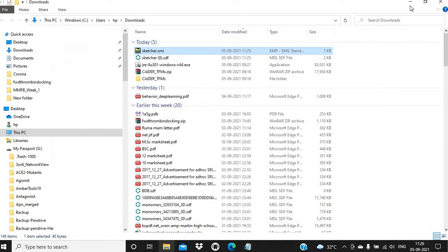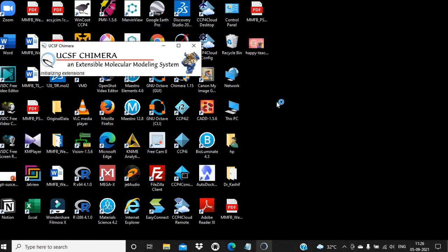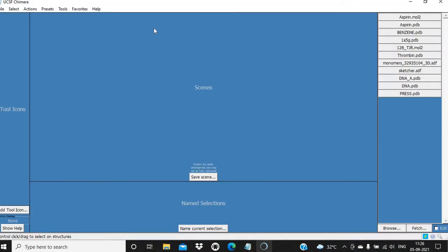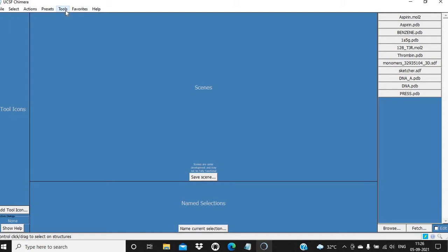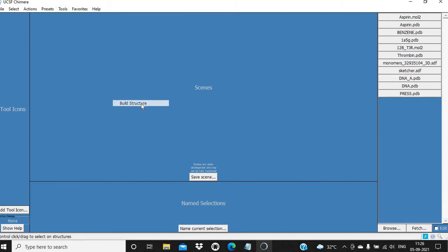So now we are going to use UCSF Chimera to visualize this benzene structure. I am going to use the latest version of Chimera, which is 1.15. In order to use the SMILES notation, we have to click on the Tools menu, then go to Structure Editing, then click on Build Structure, and you have to check the radio button for SMILES string.